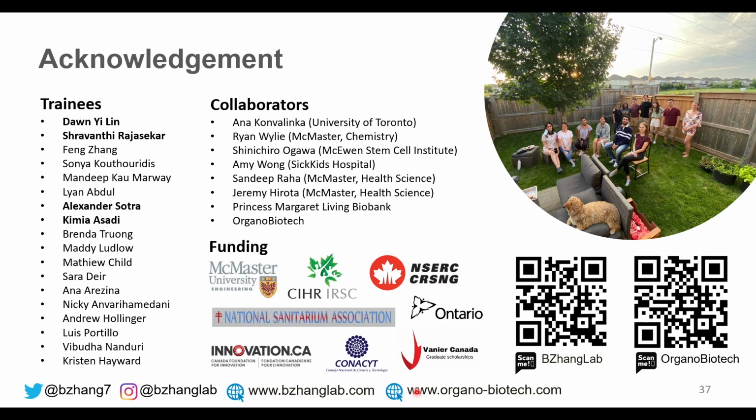Thanks for a great talk. I'm Sanjay from Seoul National University. I have questions regarding the colon models. You showed two colon organoid models. Can you compare the two types in terms of the benefits, like in testing some sort of efficacy, is it better to use this model compared to the other? Can you compare the benefits of the two colon organoid models you showed?